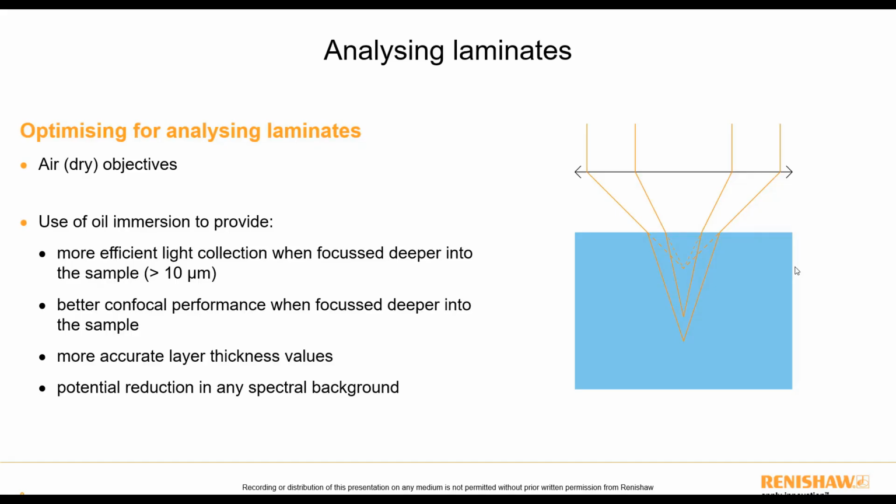Your oil is effectively refractive index matched to your sample. And that means that we don't have to worry about the refraction, and we end up collecting data from effectively where the dotted lines are on here. And you can see that's the same distance as this distance the sample was moved, x. So it makes it much simpler to understand how thick layers are.